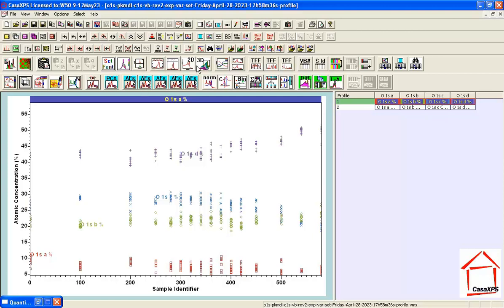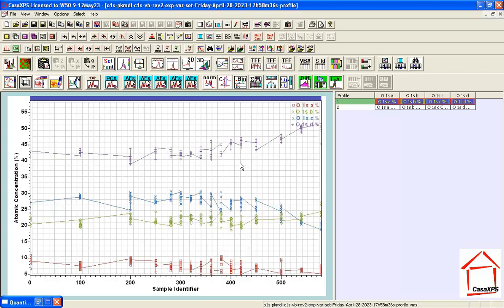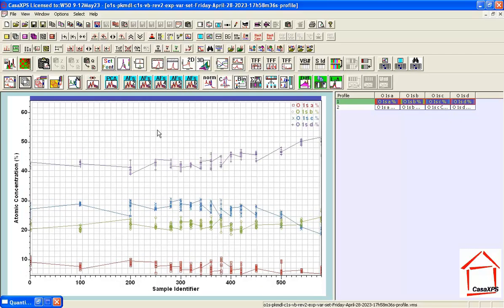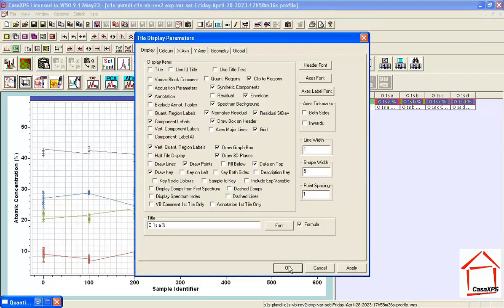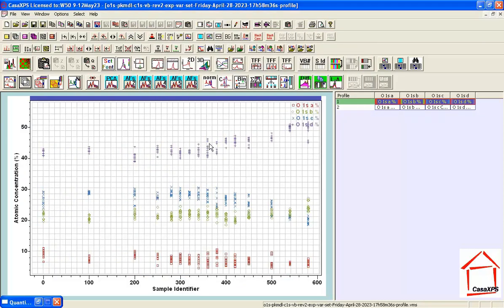Using the profile display button, the peak model suggests three components that are very similar in their response to temperature changes, and one component that starts to increase at the point where temperature rises. If this component represents the chemistry that changes as temperature rises, that would be corroborating information that the peak model has produced something physically meaningful. But you still need much more research than what I've done right now to come up with a peak model that you feel is best at analyzing a data set such as this.